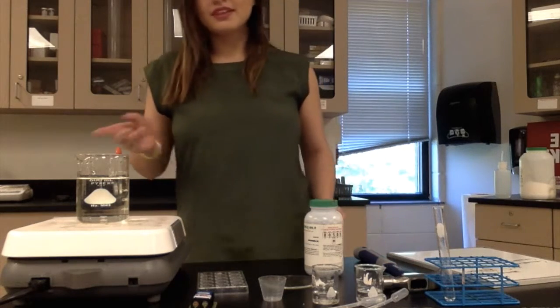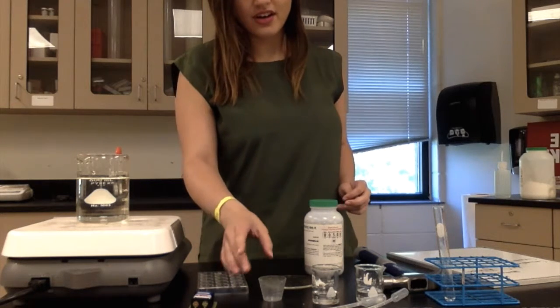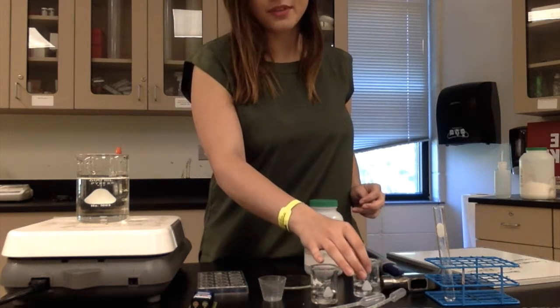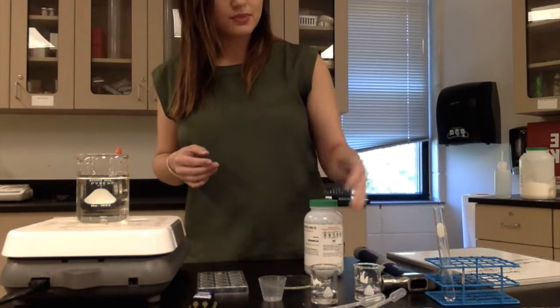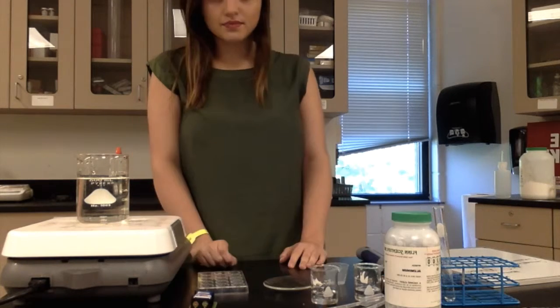For this lab, you'll need a large beaker filled with tap water, a hot plate, a reaction well, a conductivity tester, a Pyrex watch glass, a sample of distilled water, a sample of hexane, and pipettes, a test tube rack, test tubes, a hammer, and your samples. For this demo, we'll be using aluminum.